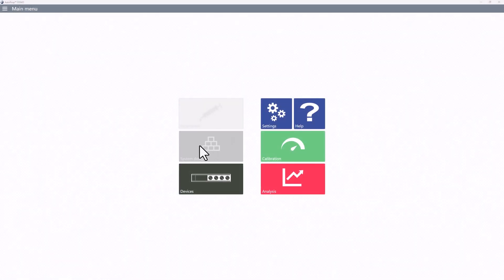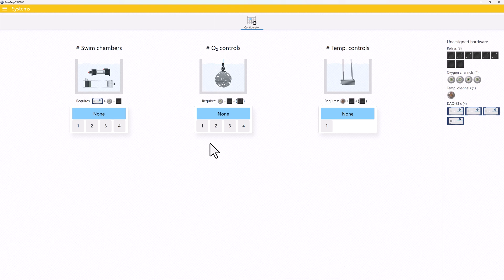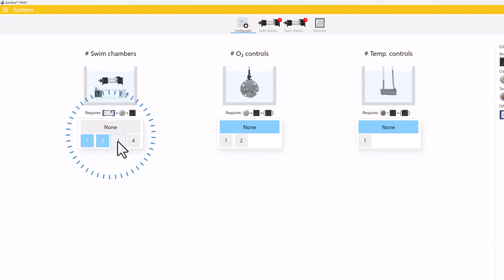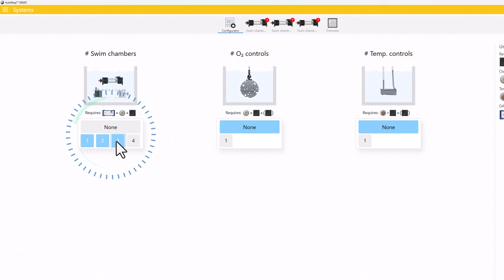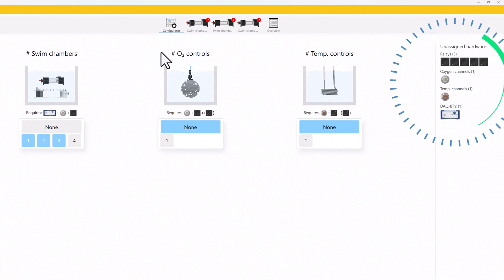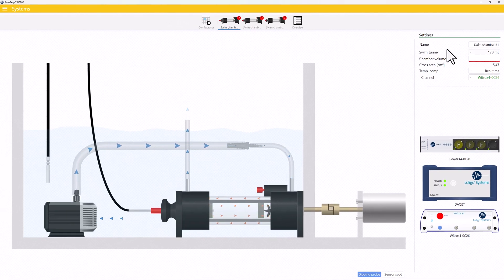For newcomers, the new system designer will be a helpful guide in quickly setting up your system. The tool shows you the number of available channels based on the connected hardware and each setup is illustrated with live animations.